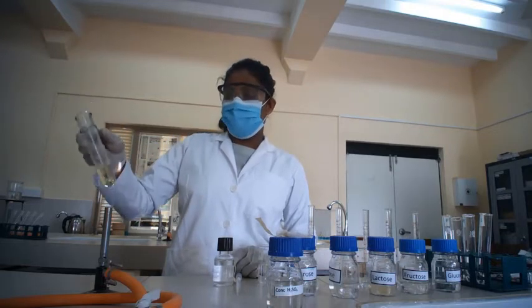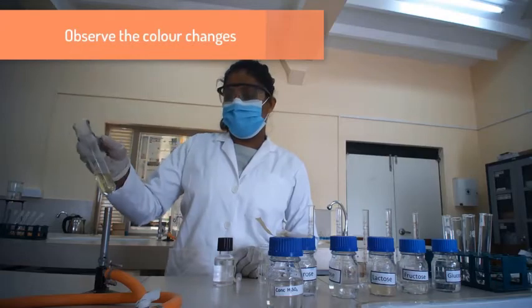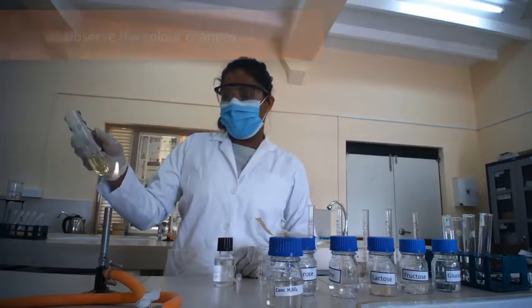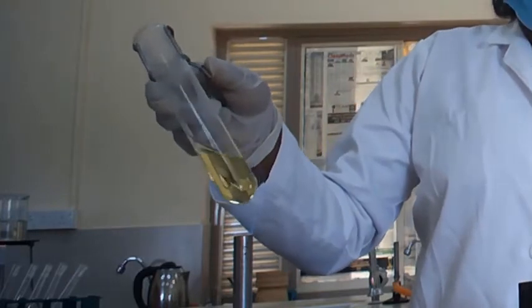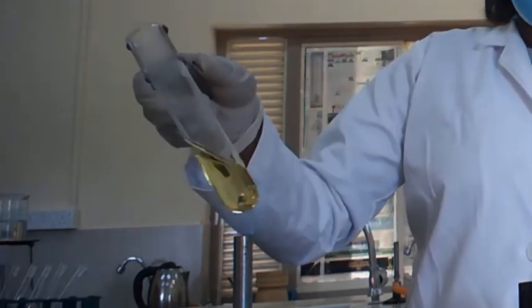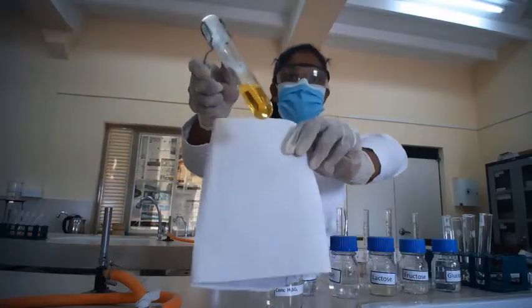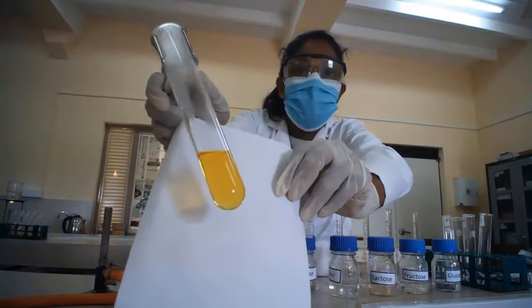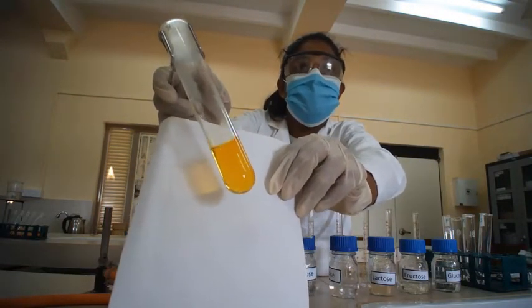Now you can see the color has changed from colorless to yellowish color.